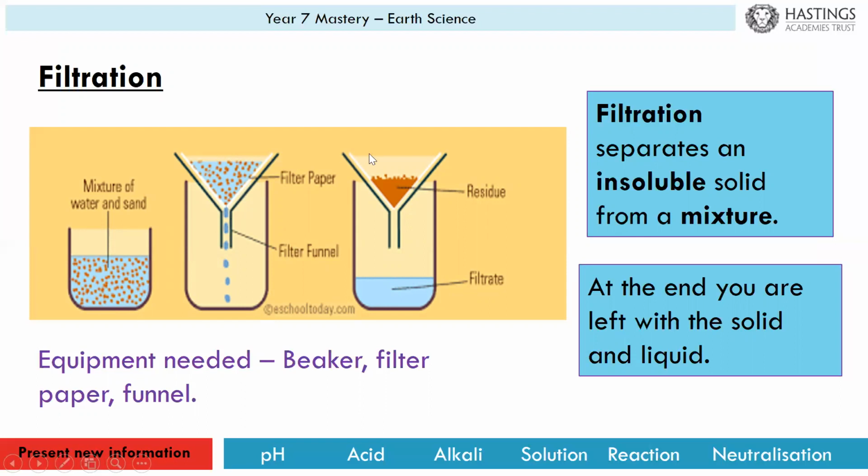Once you've done that, you pour the liquid into the filter paper. The water will then start to run through the filter, and all the residue, or all the insoluble solid, will remain at the top, and the liquid will filter through and end at the bottom. So that is filtration in a nutshell.